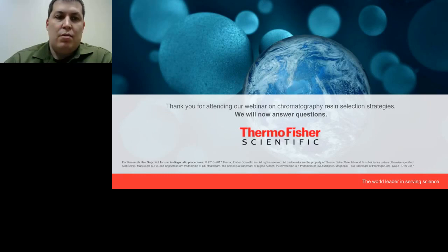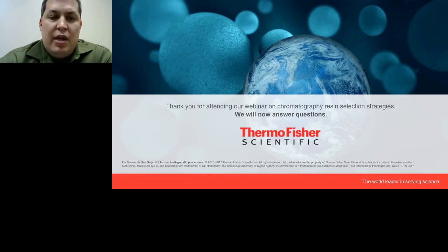Thanks for that question. So really, they can be used in spin columns. You just don't get all the benefits that go along with the poros chromatography resins. Gravity flow, however, they significantly slow down the flow rates due to their bead structure and the small particle size. So it's really not recommended for gravity chromatography.